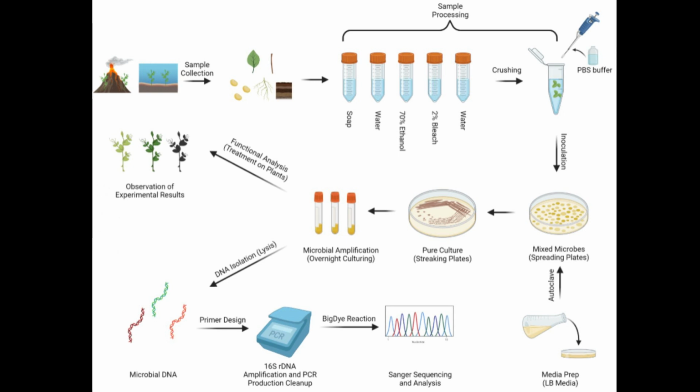Next, a PCR reaction was done. To do this, a lysis buffer was made with the bacterial culture and then neutralized with tris-HCl. This is beneficial to denature the DNA and detach it from the histones. It also stabilizes the pH, which is necessary in order to amplify the genes. After the lysis buffer is done, the tube is centrifuged and the 16S rRNA amplification can be further processed. The 16S gene is used because it is optimal length and it contains all the necessary information.